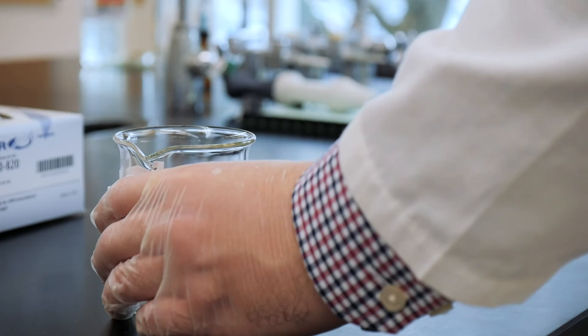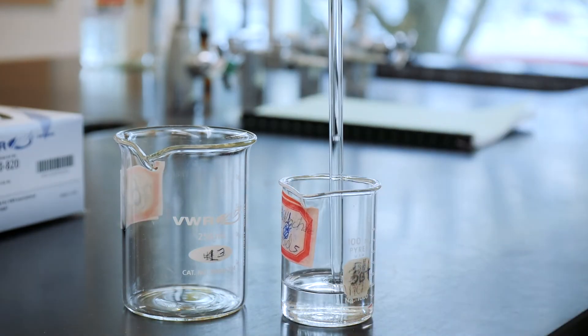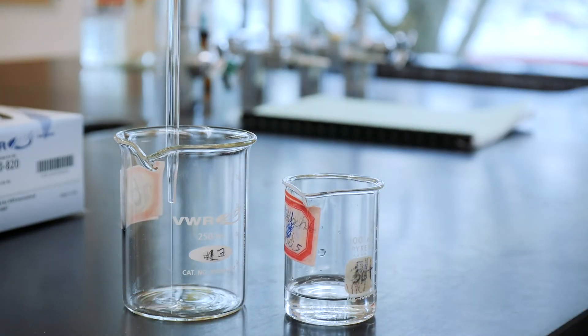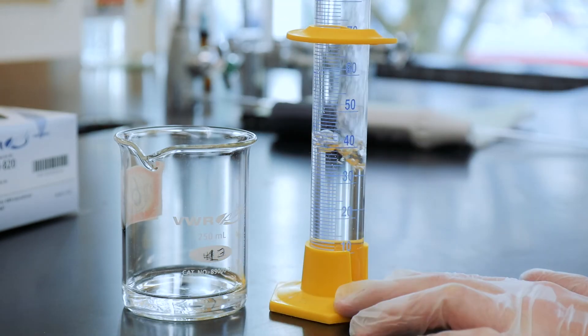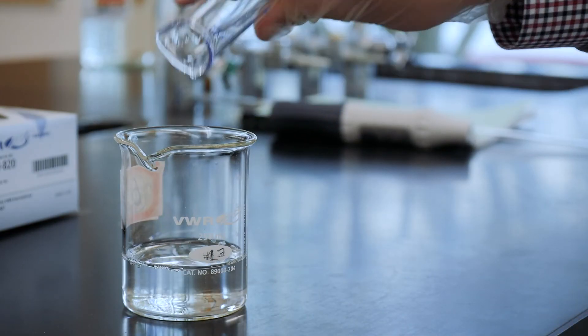Pipette 25 ml of the phosphoric acid solution into a clean 250 ml beaker. Then add 50 ml of deionized water so that there is enough liquid to immerse the pH electrode.